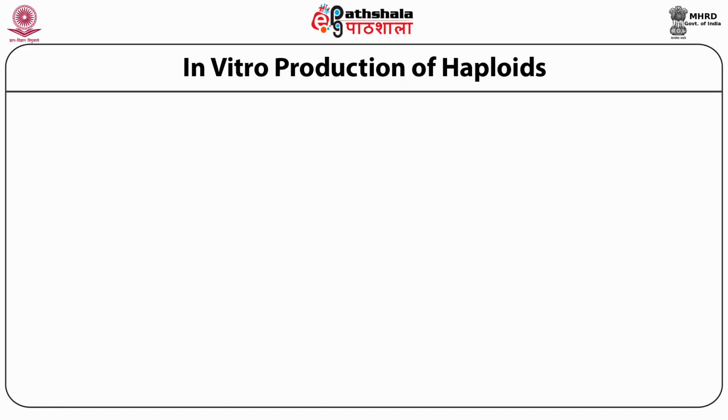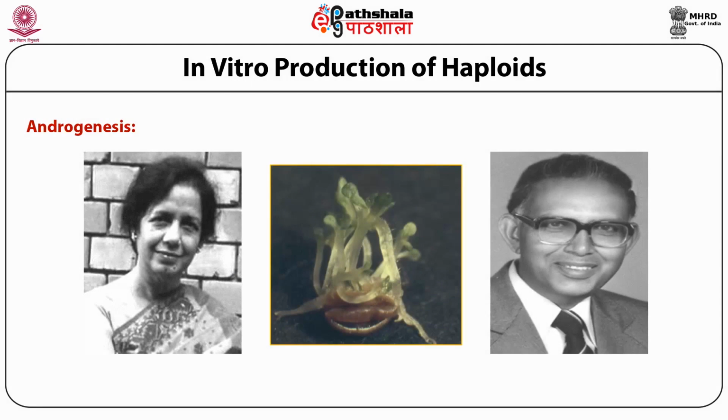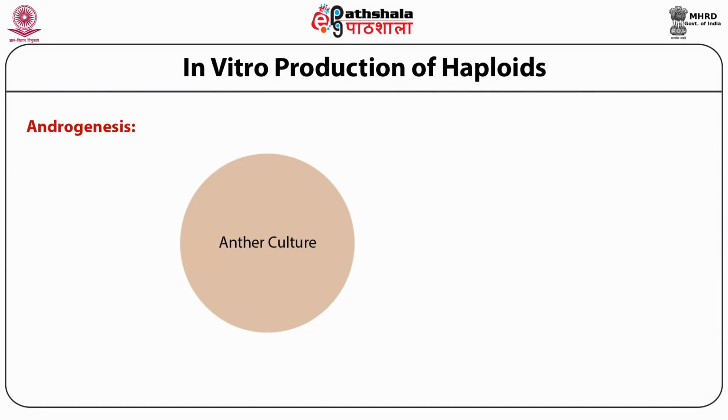Now, there are two methods in androgenesis to produce haploids. Initially, as in the case of Datura in 1964, when Guha and Maheshwari were working, they cultured anthers. You culture the anther on a standard tissue culture medium, and the pollen grain inside will respond to it. Soon people realized that once you have induced the pollen grain to form plants, you don't know what is happening inside the anther culture until the anther bursts open. Also, the treatments that you apply first come in contact with the anther wall, and then enter the anther wall and reach the pollen grains. One does not know how these chemicals are modified by the time they reach the pollen grain.